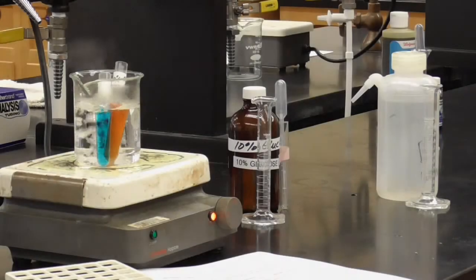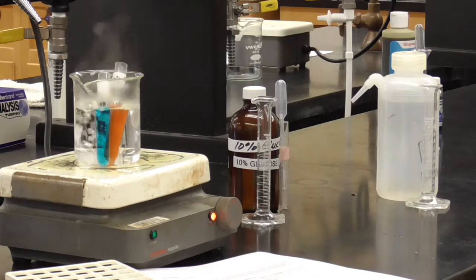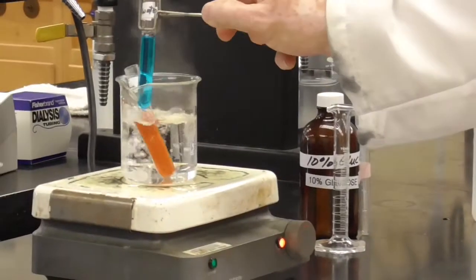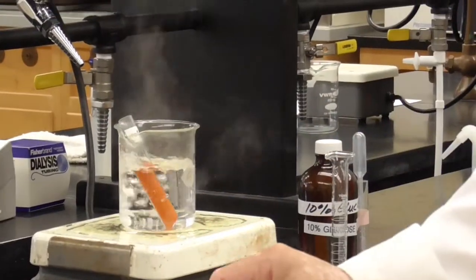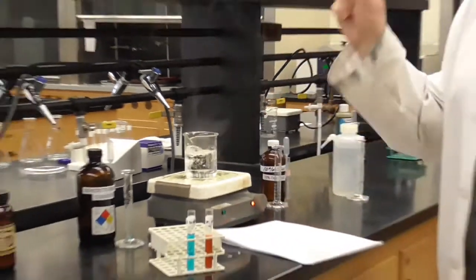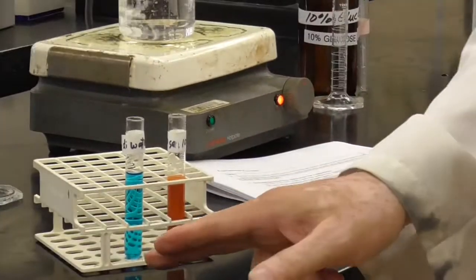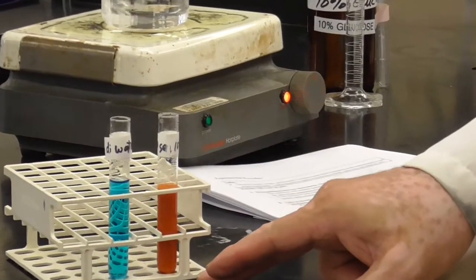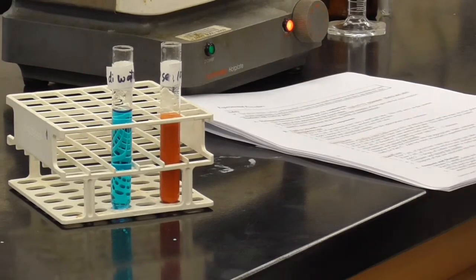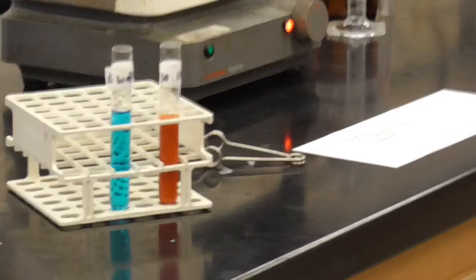Okay, all right, it's actually only been about 1 minute, but we already see a huge difference between those test tubes. Let me go ahead and take them out. Here's our negative, with just the DI water, and here's that positive with the actual 10% glucose. It's really easy to tell the difference, right? No glucose, or positive, yes for glucose. Very easy to tell whether that's present or not. So these chemical qualitative tests are really useful. Kind of fun to do with colors. All right, let's move along.